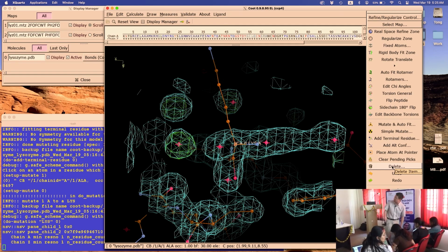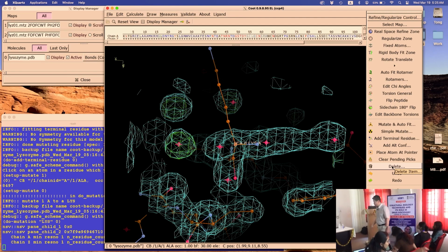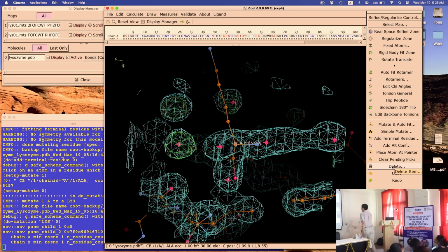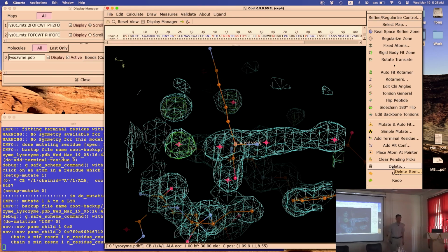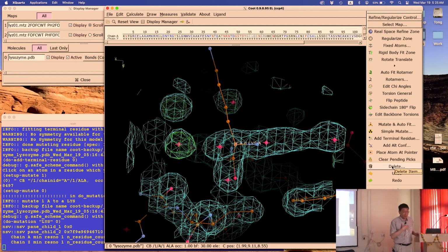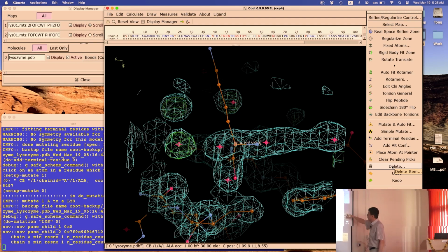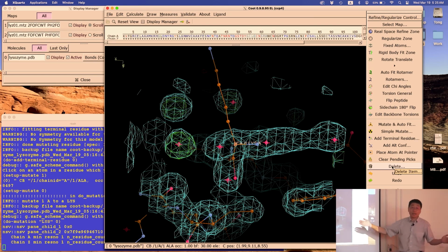So that's one of the, that icon. You don't have an icon here. This icon. So if you're not good at Coot, like me, I suggest you keep the text here too. Many of you only have icons. I have no idea what the icons are.